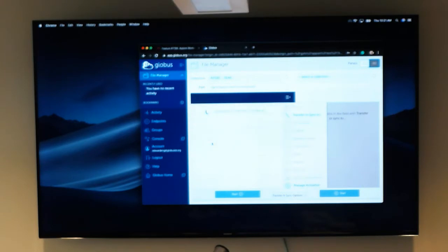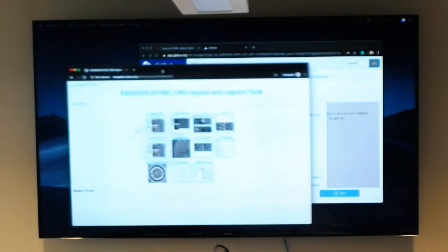Something that's interesting in the stacks would be if you create several different stacks, they're actually box files here. So then you have your coordinate picks. Okay. So now that's where you find your data. Let's go back into the web browser so we better understand how we generate all this.